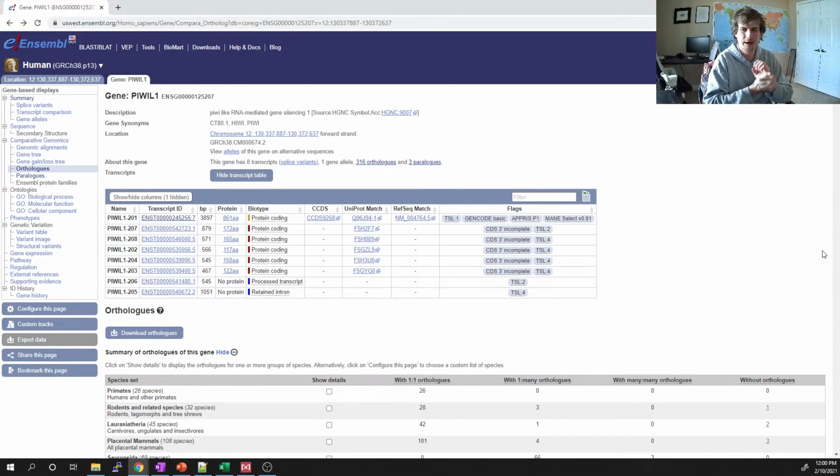So I've updated some settings, so I hope this works better today than it had yesterday. But you know, we'll find out.